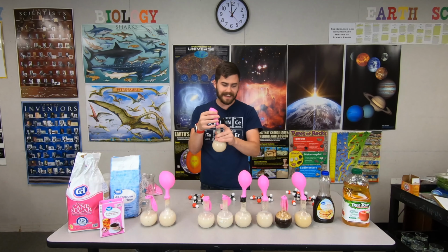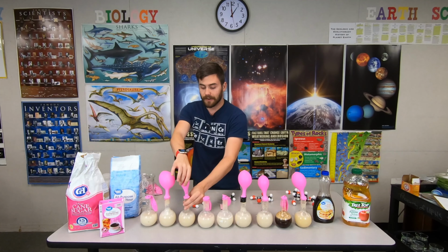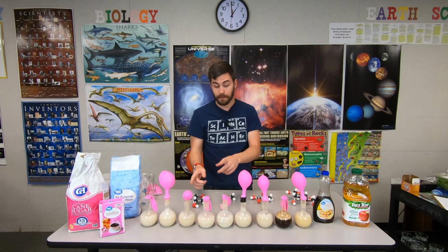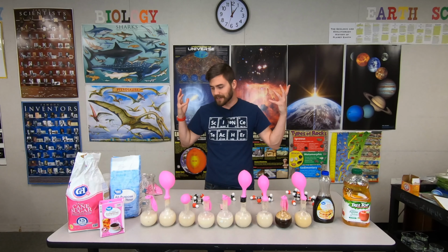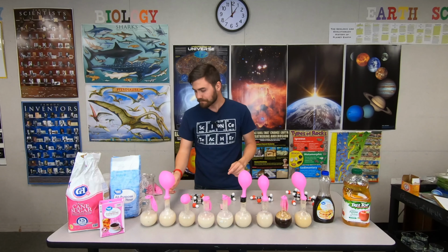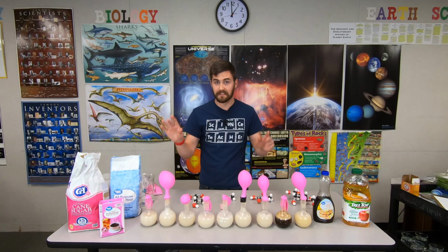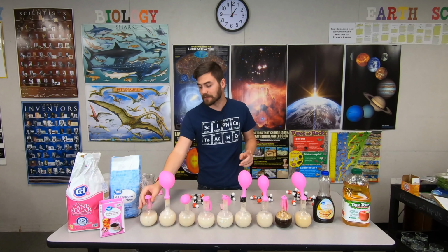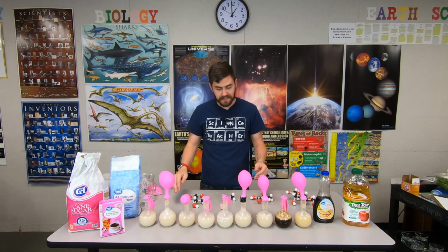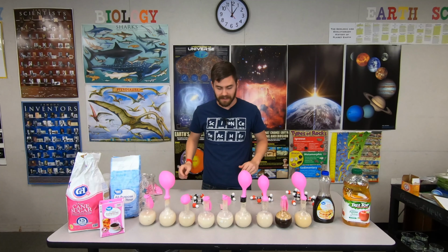It could be that I had a tiny leak here. It could be that there was a tiny bit of air in there. Now, in a better experiment, I should say, I would have multiple of each of these items, but I don't have that kind of money right now, unfortunately. Now, our control balloon has no gas in it whatsoever. That is to be expected. There was no source of food in here, and no gas is produced. No real metabolism of any kind went on in that flask.